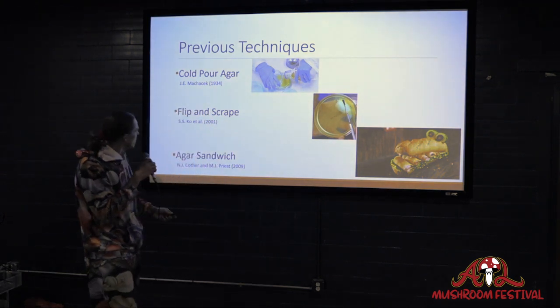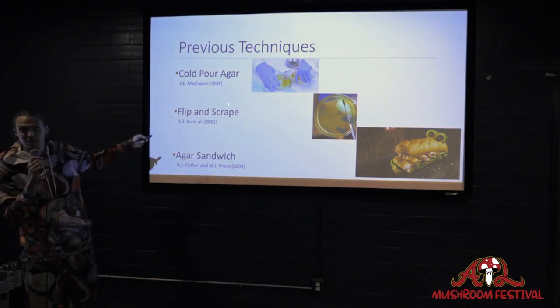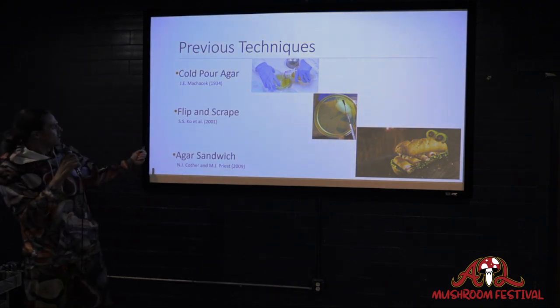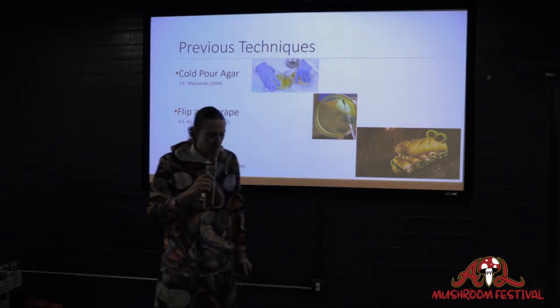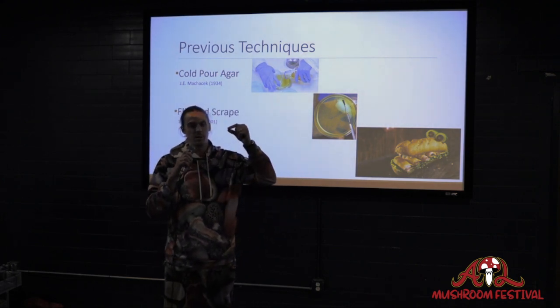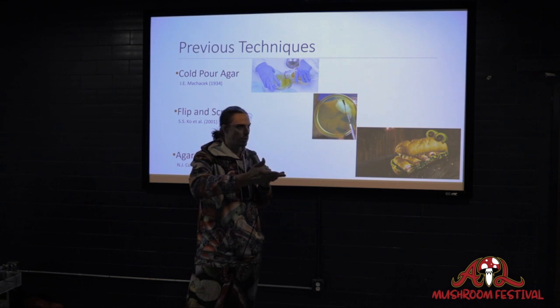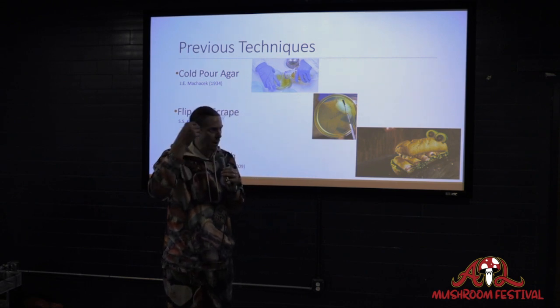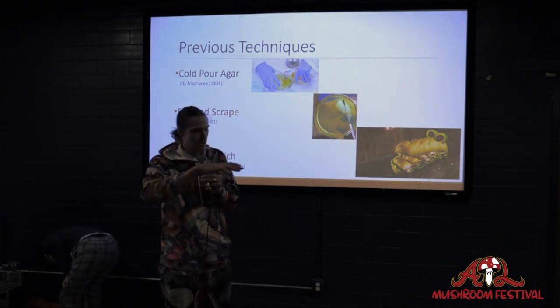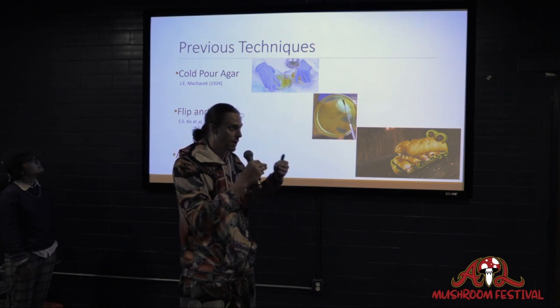And so later on, you can see here, there's almost a 70-year gap between any innovation that's happened. And so now you go to S.S. Coe, and he developed the flip and scrape technique. So what he would do is take the contaminated piece, put it on top of the agar, let the contaminated piece grow through the agar, and then he would cut a window in the back of the agar plate if it was a plastic plate, and select some agar from the back of the plate, or he would flip the entire plate over and select from the back of that plate by flipping it. So if it was like a glass plate, you can't cut through it.